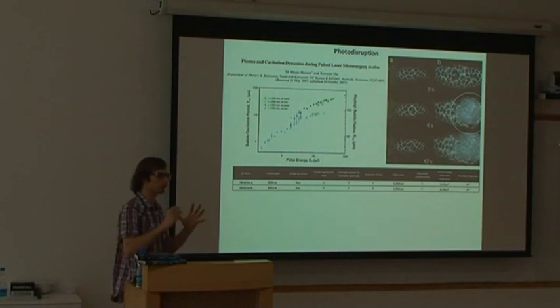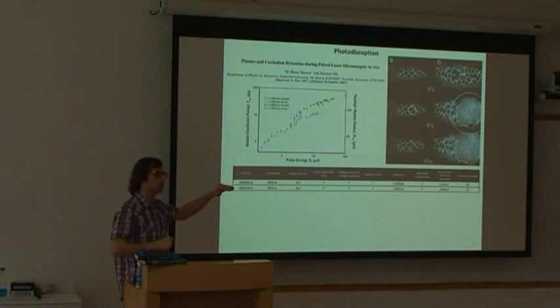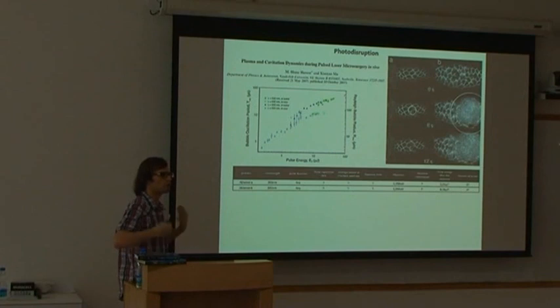Because your photons are so much spread in time that you have to use higher power to reach the plasma threshold. In that way, you will ablate, but at the same time, all the photons which are remaining will create surrounding destruction. So it will create shockwave or plasma or bubbles.